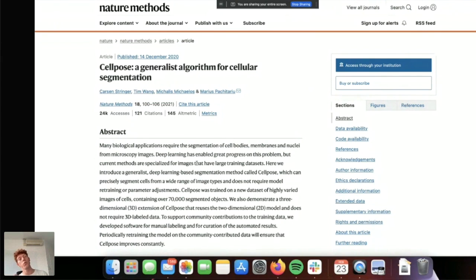The main goal and the main scientific process that we'll try to follow is to train a new model. So this dataset was suited for segmentation, but we will use it for object detection just to make the use case simpler, and also because object detection is suited for cell counting.